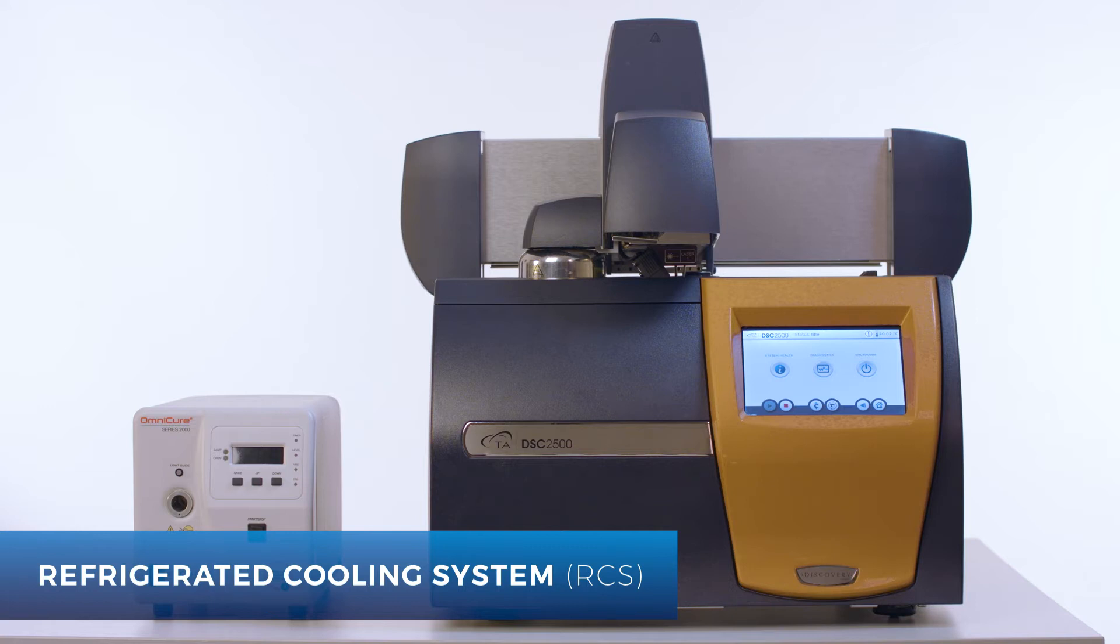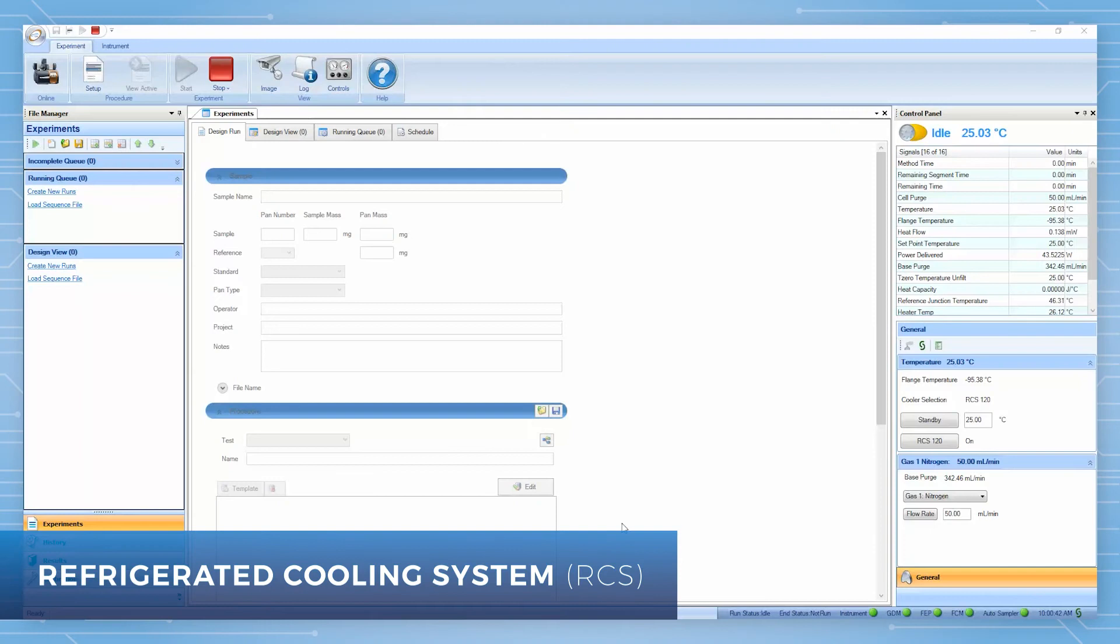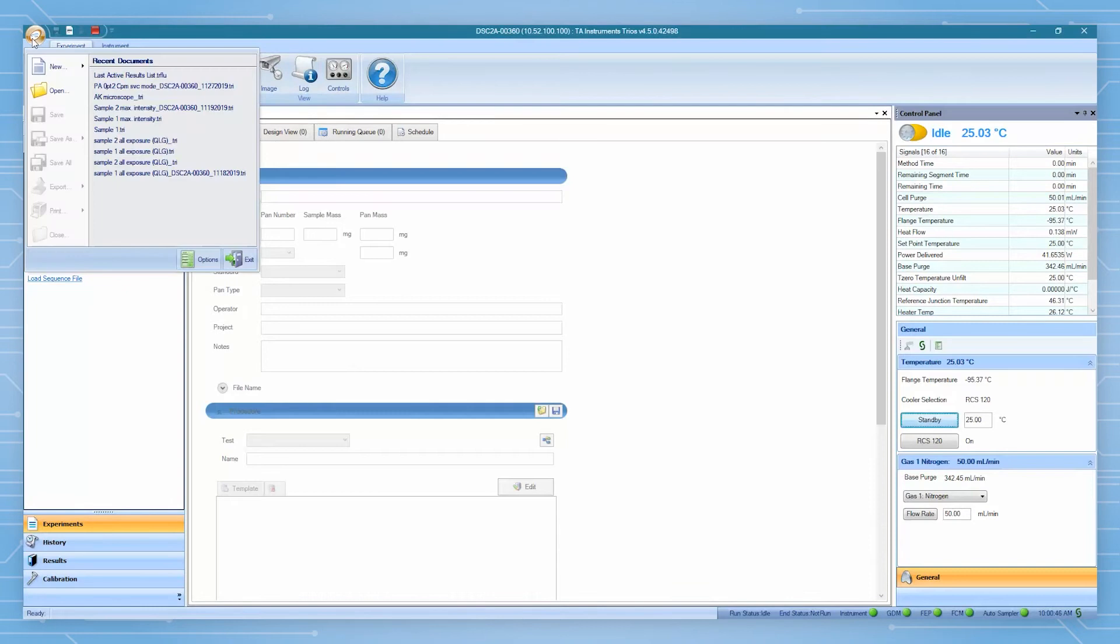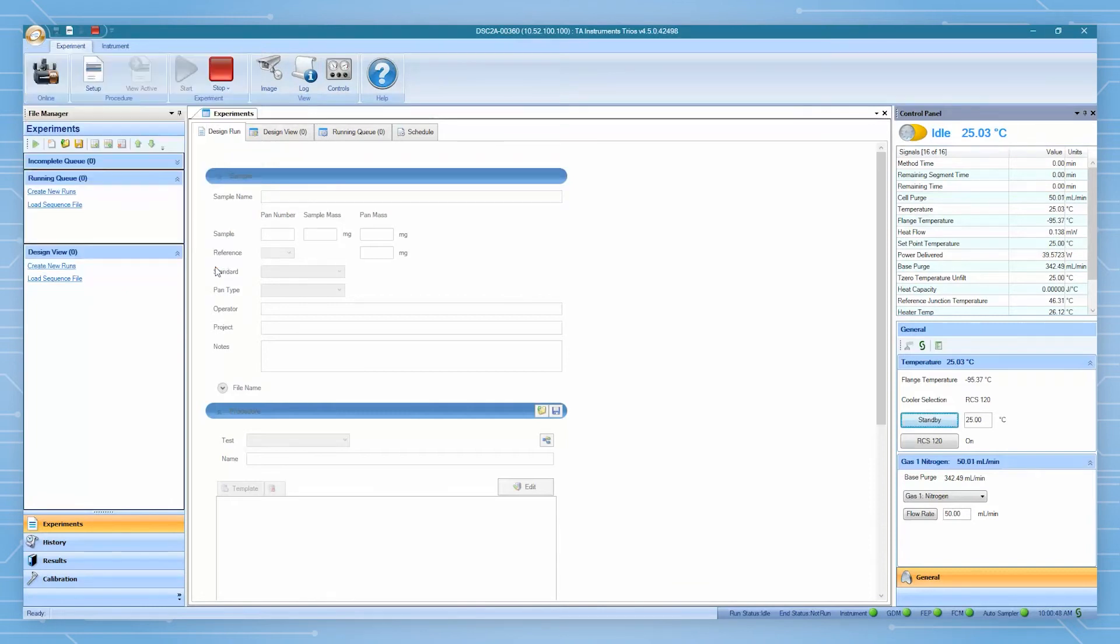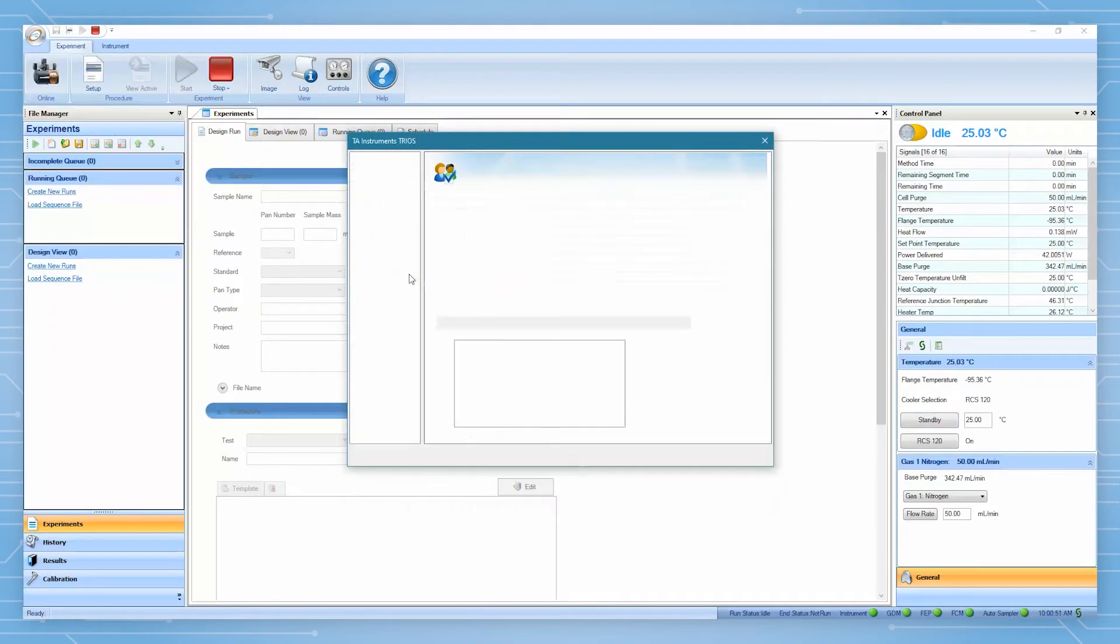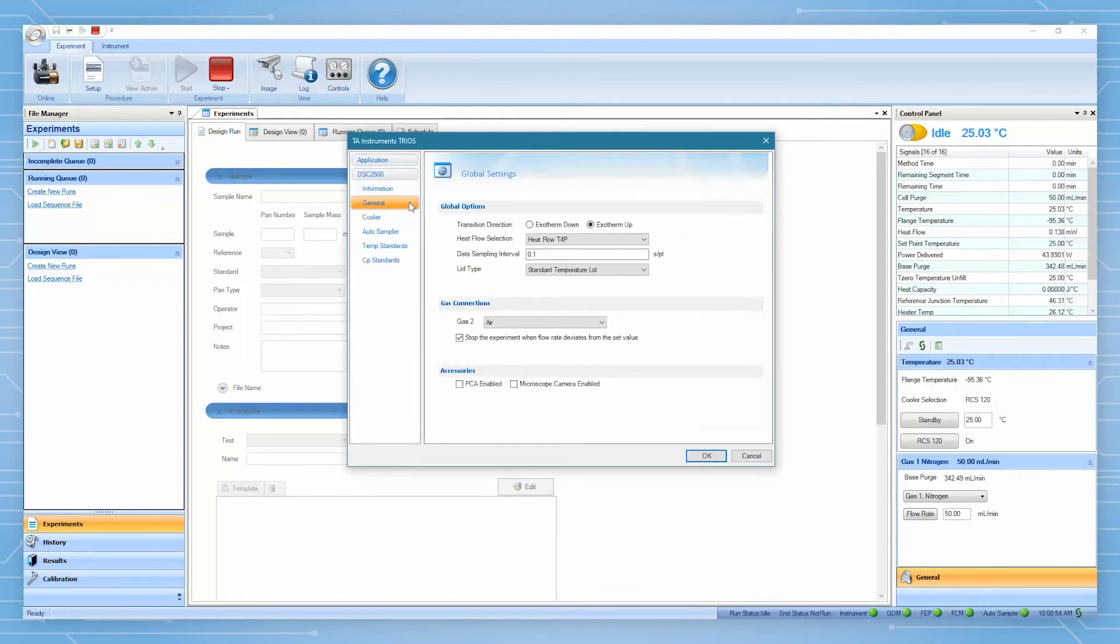The PCA is designed to be used with Discovery DSC and is required to be run in T4 or T4P heat flow mode. From the TRIO software, go to TRIO options, General, and make sure T4 or T4P heat flow mode is selected. Make sure PCA enabled is checked.